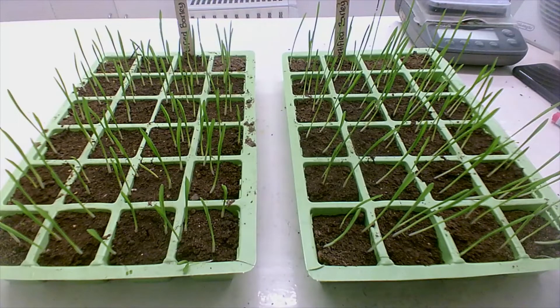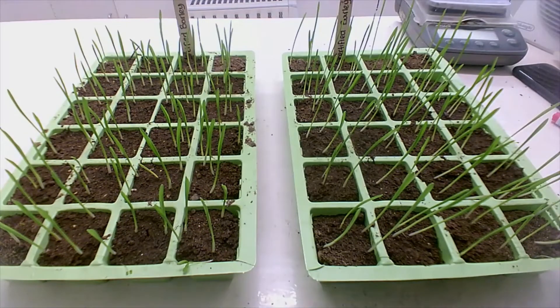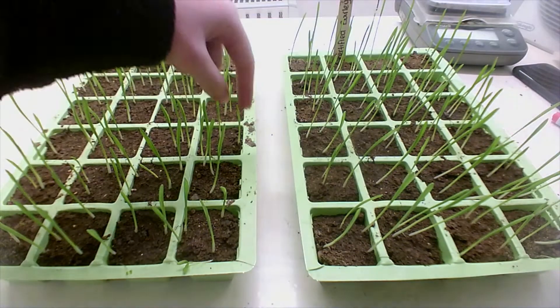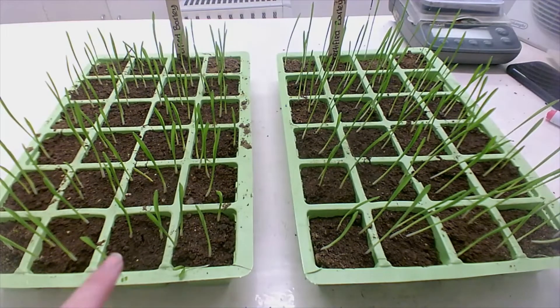So the first thing I'm going to do is count how many of each seed have germinated in the uncertified and the certified barley. There are 83 germinated in this one, and 91 in the other.